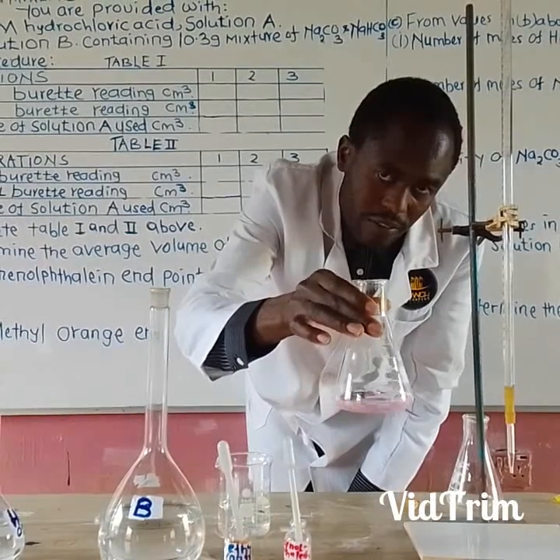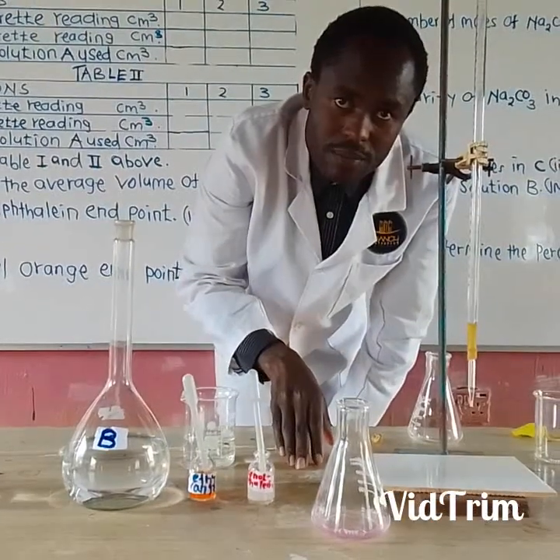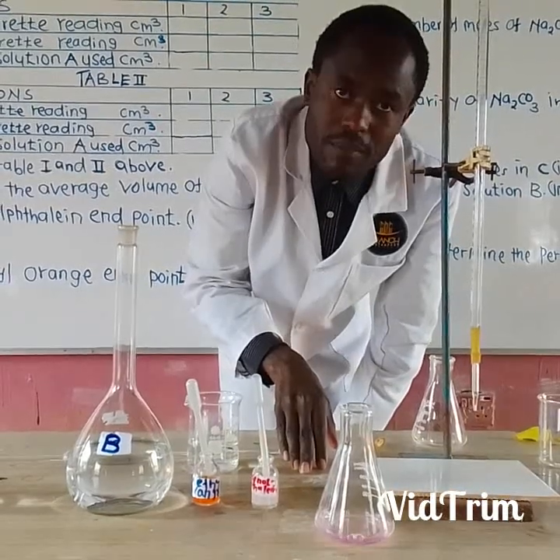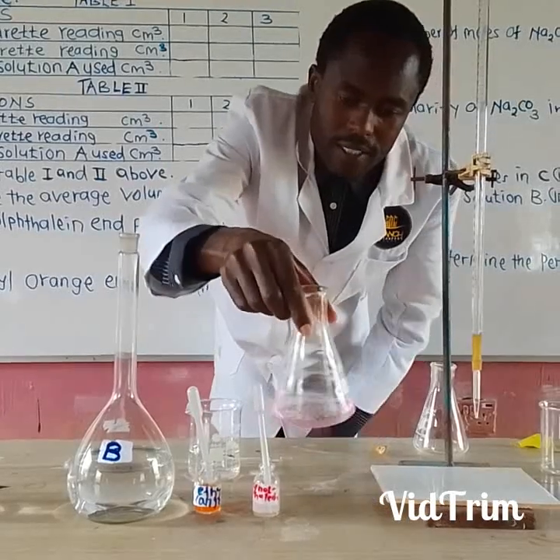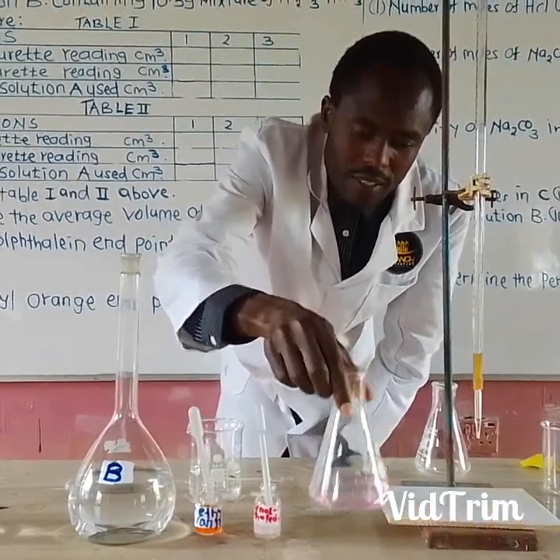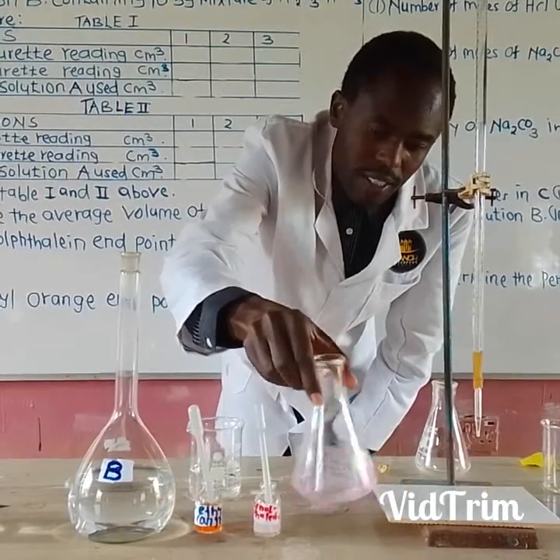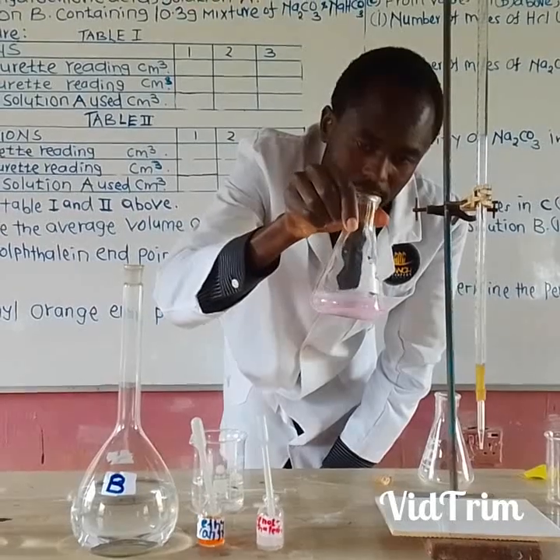What's the color after adding phenolphthalein indicator? Is it pink? Is it pink, my student? Yeah, you can see it is pink. The color is pink after adding phenolphthalein indicator. Let me shake so that you see. Is it pink? Pink, isn't it?